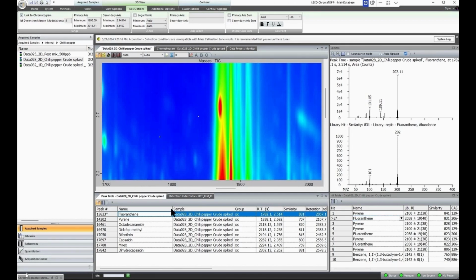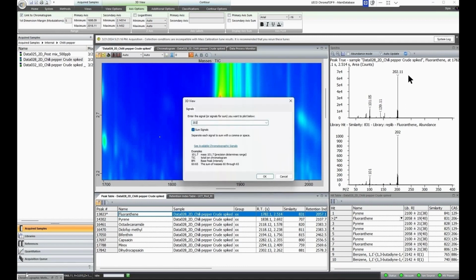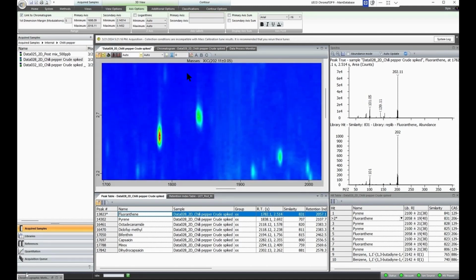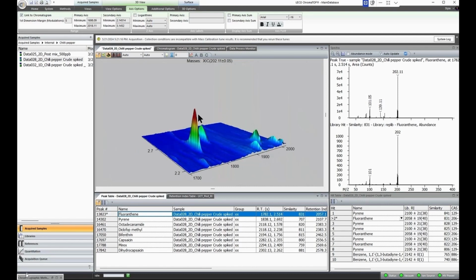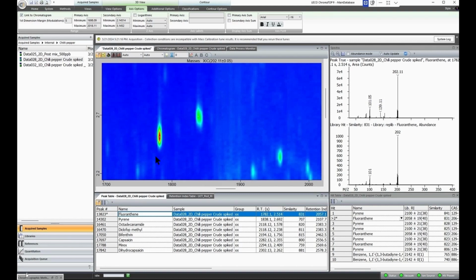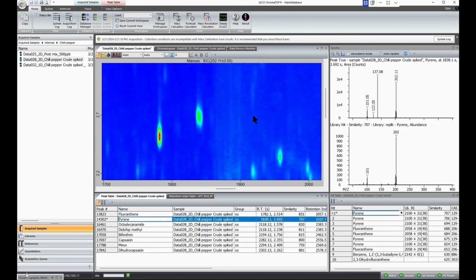Indeed, if we click on the peak markers, we have the fluoranthene. And if we look at the mass spectrum, it's pretty much the same as the one in the library. And as soon as we type in, as usual, our selective m/z fragment, this peak will pop up and we see a clear peak, and that's the presence of a PAH in our chili pepper sample. Same thing for the pyrene that is eluting over here. There are some interferences on the spectrum, but still the identification is pretty good. And we have a clear peak, which is a sign of the presence of this component and the confirmation of its identity.